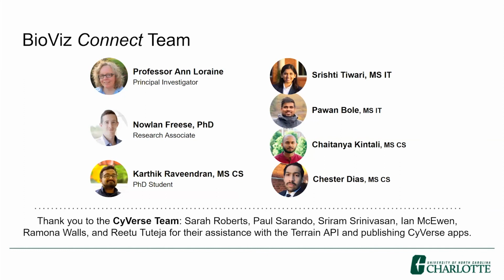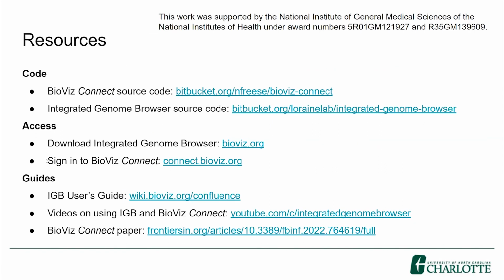This is the team that built BioViz Connect, and I would like to thank the CyVerse team as well, because they helped a lot whenever we hit a roadblock. And these are the Bitbucket resources and some other links for the Genome Visualization Lab at UNC Charlotte. So that's it. Thank you.